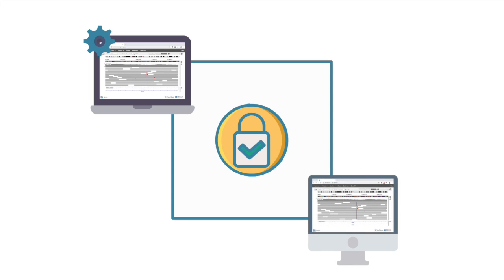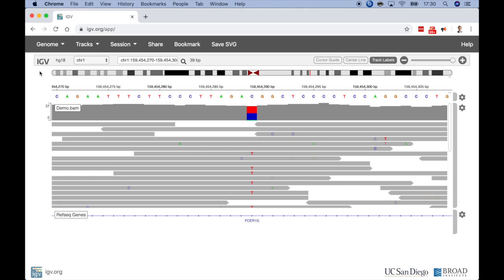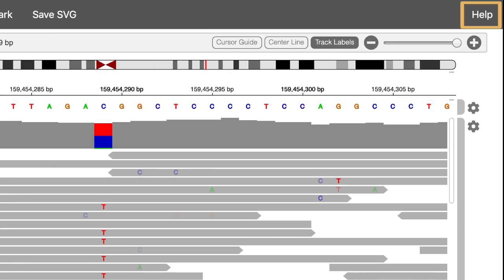The IGV web app runs completely in the web browser. It's not connected to any backend IGV server. This means that loaded data only goes to the web browser on the user's local machine. Because of this, you can securely create shareable views of data hosted on a private intranet, even when using the public IGV app. The resulting links will only work within the private intranet where the data resides. For more information about the IGV web app, click on the help link.